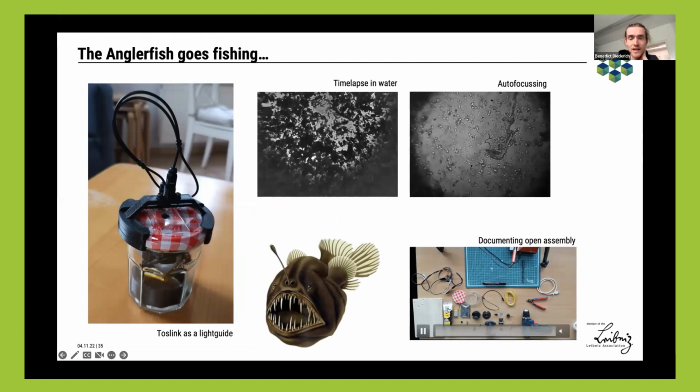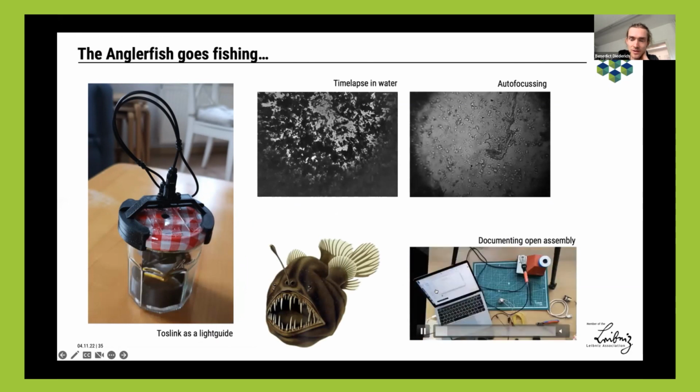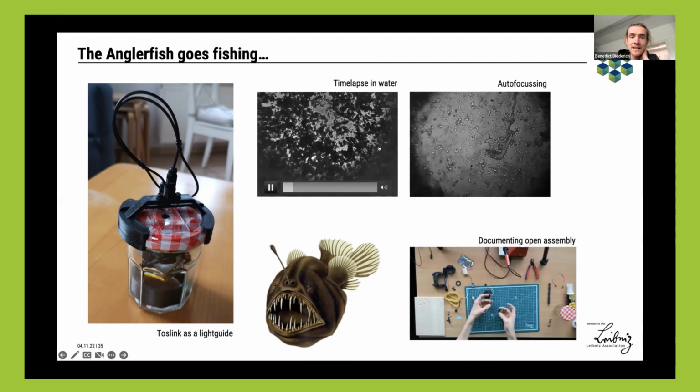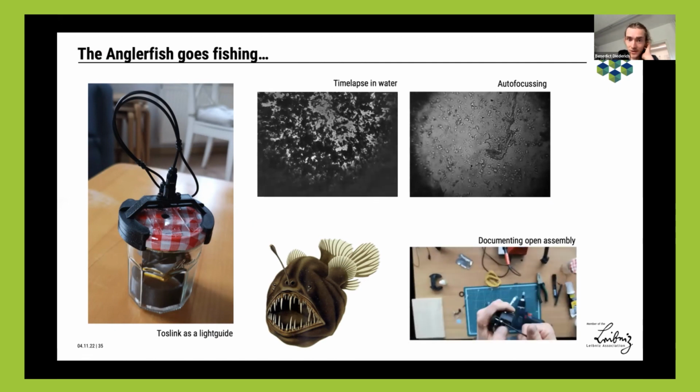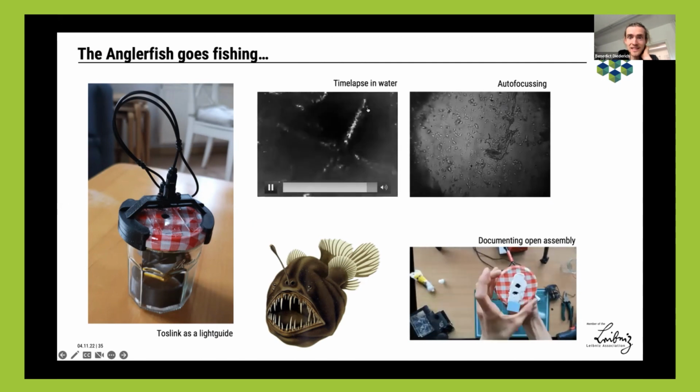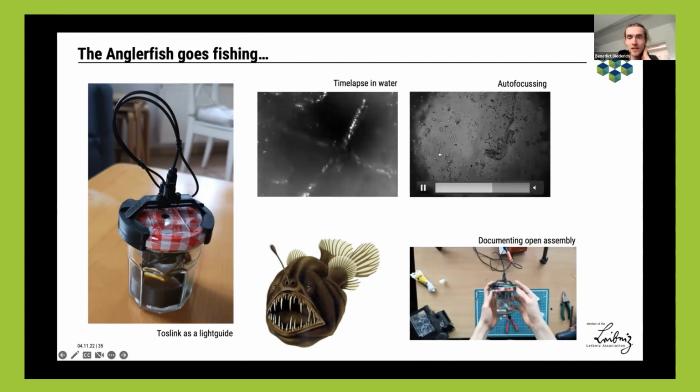And we also recently published a small assembly guide on YouTube. And this thing is just there for capturing biofilm growth underwater. So this is some time-lapse you can see here. And it also features a small voice coil motor-driven lens you can find in cell phones in order to get focusing capabilities. And also this whole thing is open source. I can provide you with the links later.